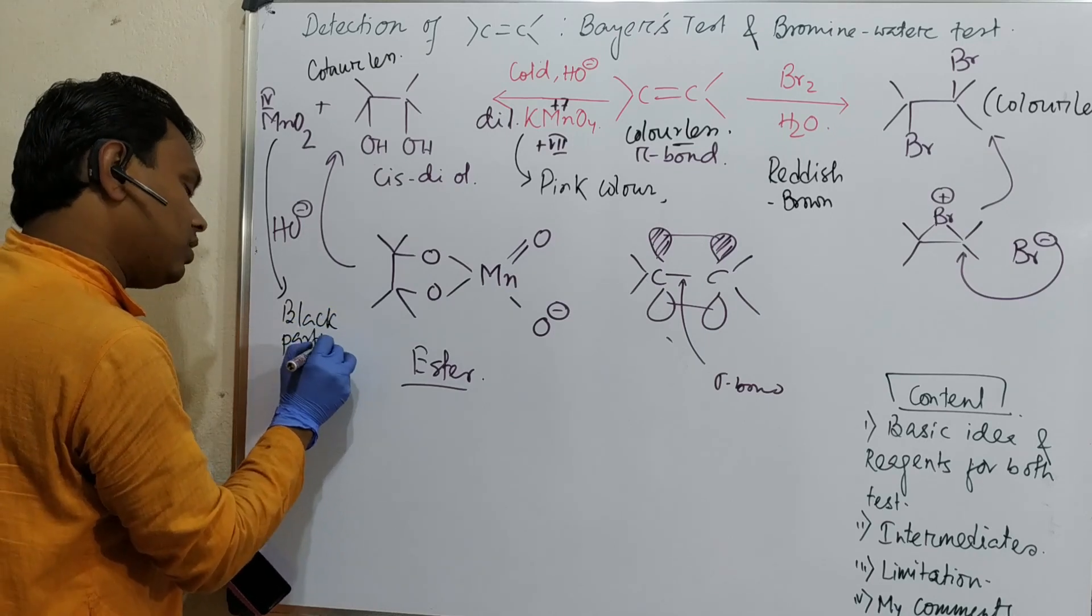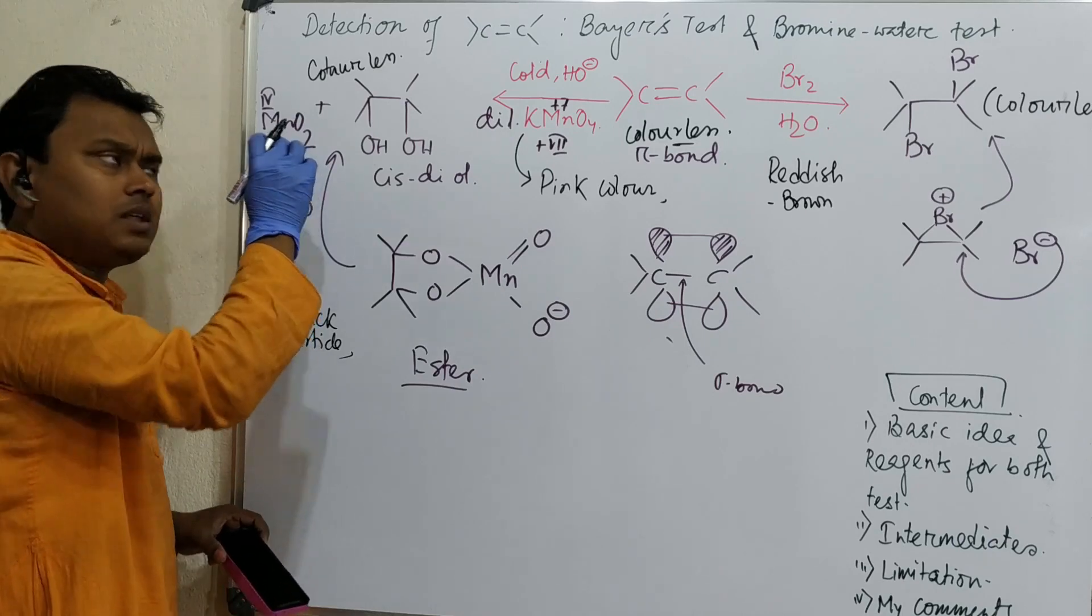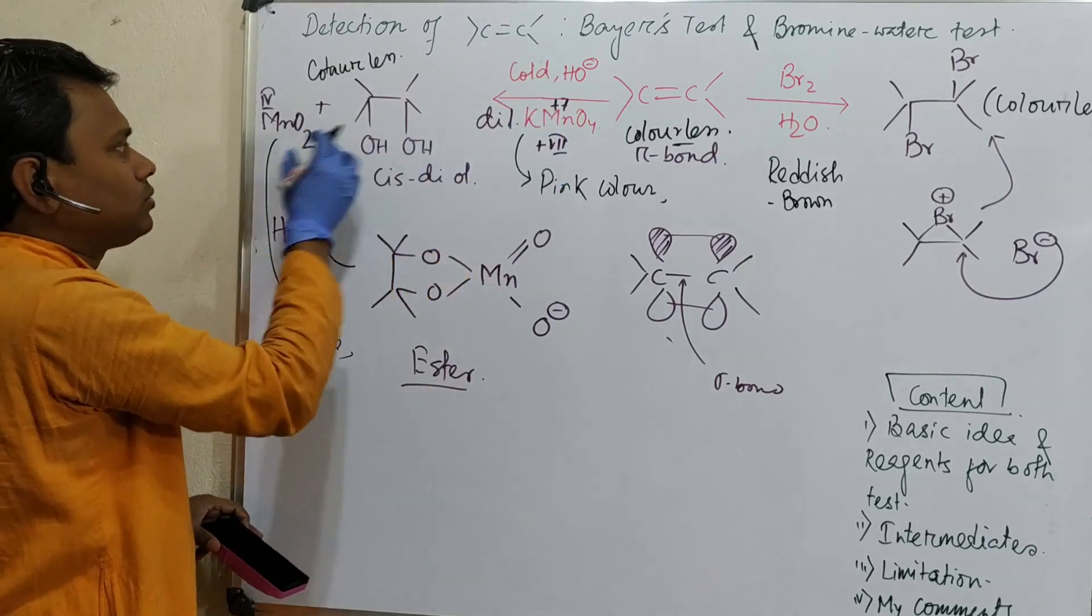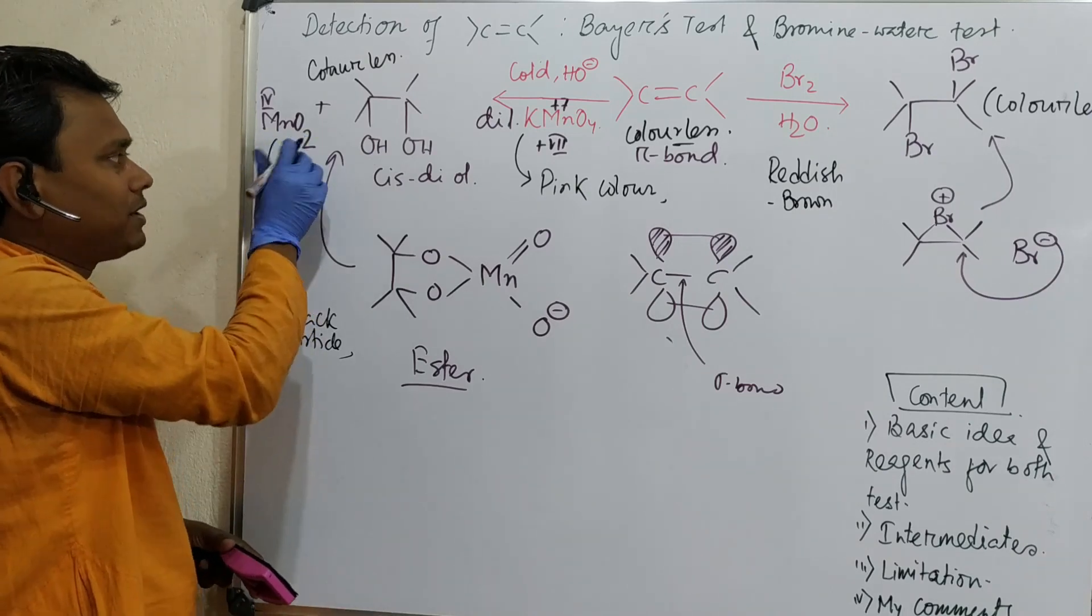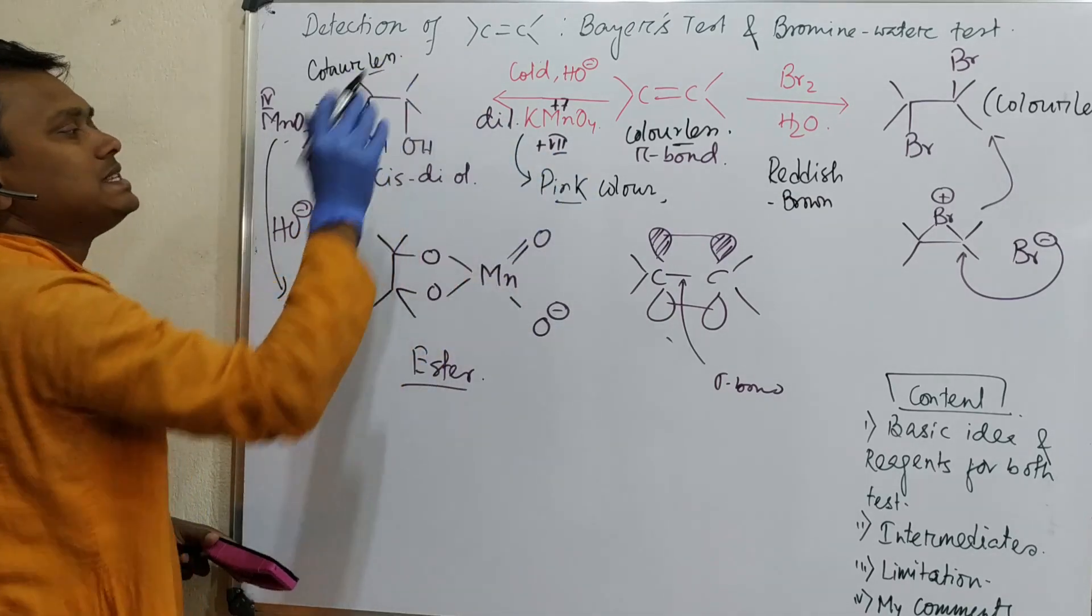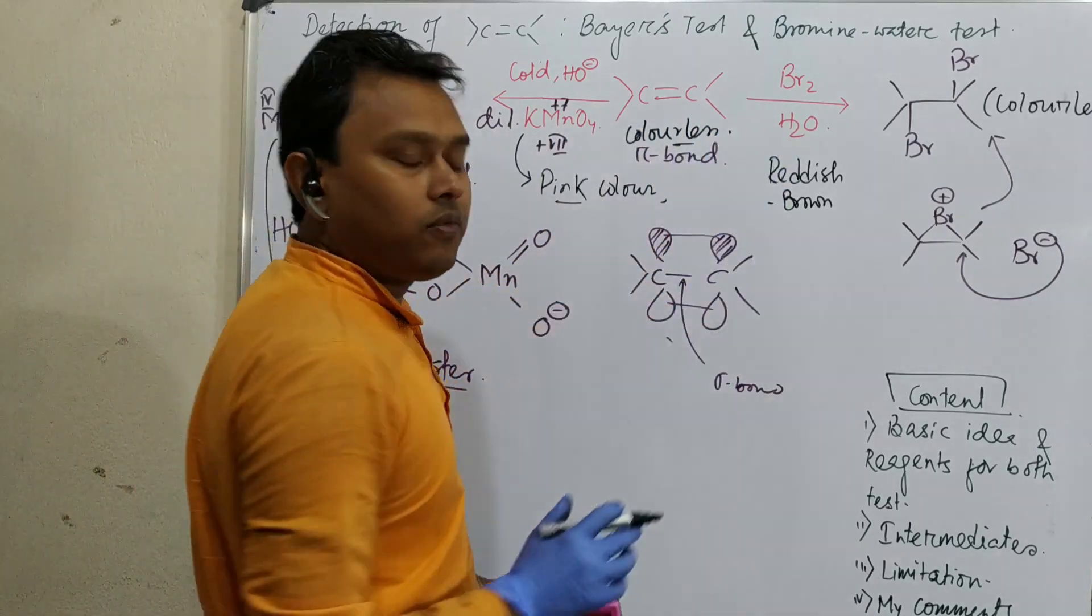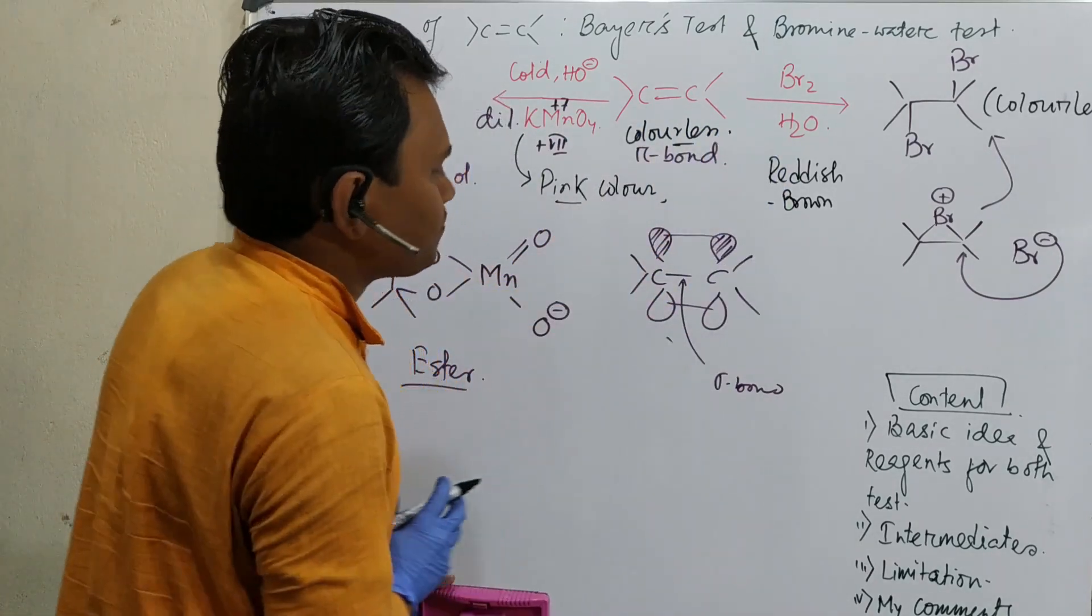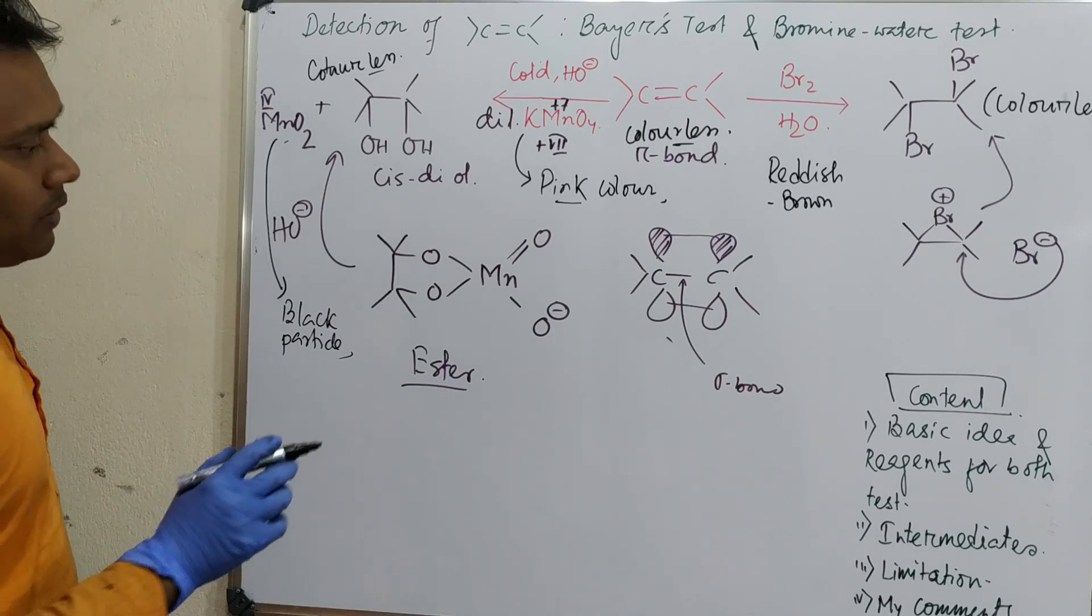But I would not suggest you comment based on this because it's very dilute and cold, so you may not visualize this thing properly. It is better not to focus on this. Better from pink color to colorless, this is the observation. So this completely supports the presence of C=C double bond.